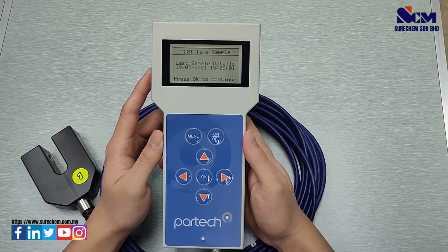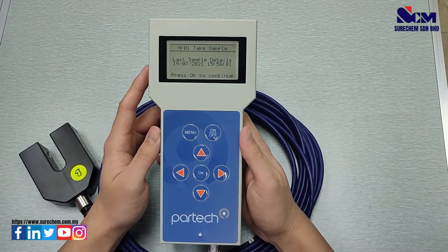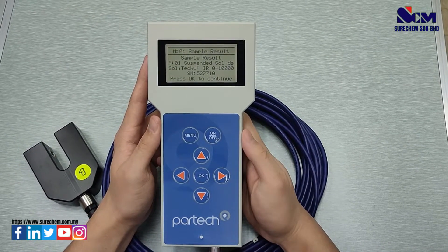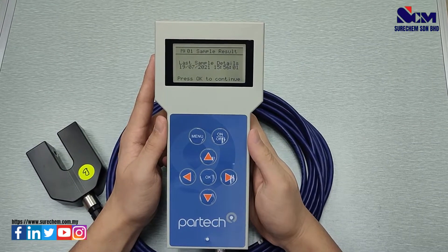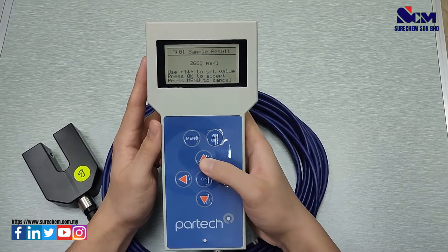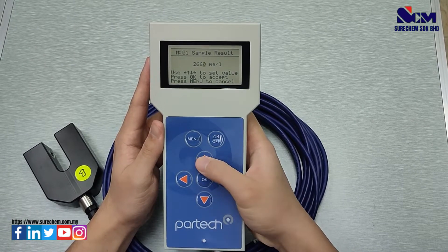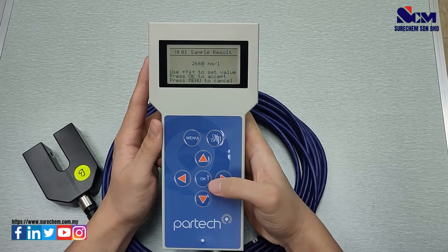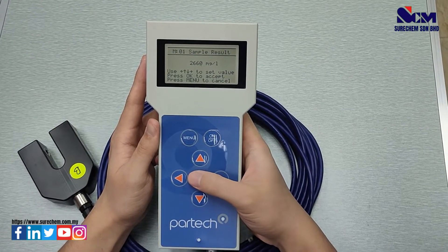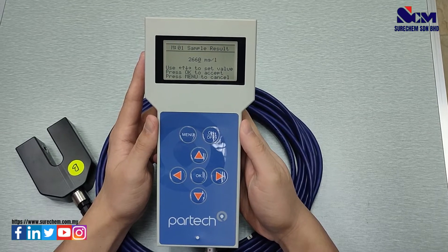After that, you will need to send the exact sample to the lab for verification. Once you receive the result from the lab, select Sample Result, press OK, select the last sample you have taken, and input the correct measurement received from the lab. Press OK after inputting the correct measurement and the calibration for TSS will be successful.